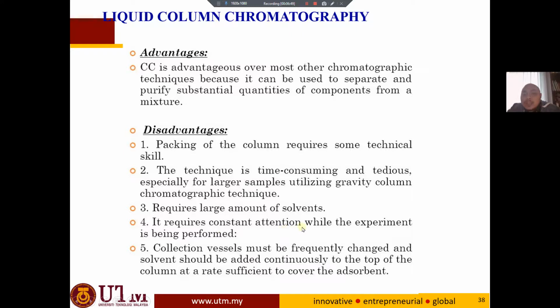It requires constant attention while the experiment is being performed. You cannot leave the laboratory or the experiment, so you need to be there to collect all the solutes or compounds that you want. The collection vessel must be frequently changed, and solvent should be added continuously to the top of the column at a rate sufficient to cover the adsorbent. Of course we can automate it, but the collection vessel must be frequently changed, because of course we use a lot of solvent, right?